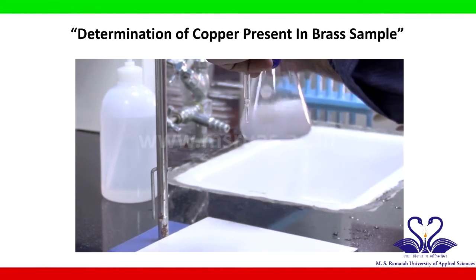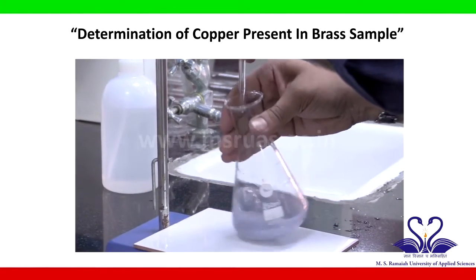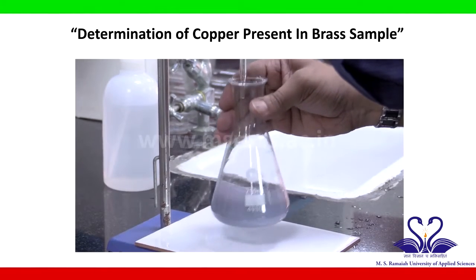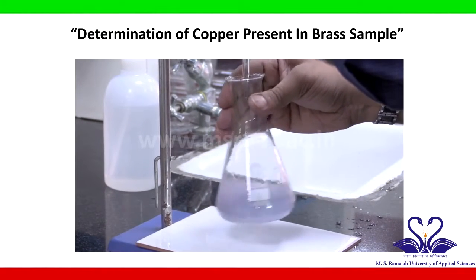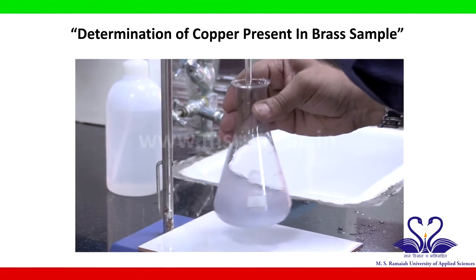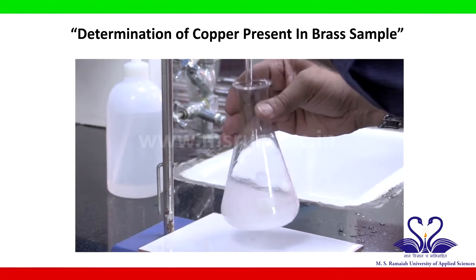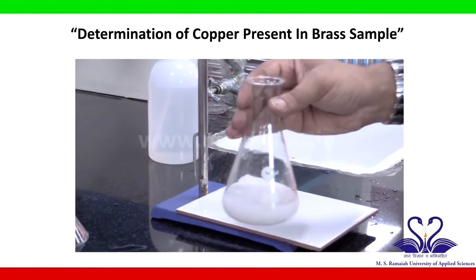Yes, we can see the blue color is disappearing, it is becoming white. Now you can see.